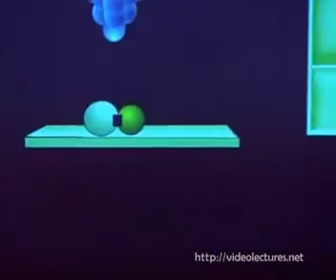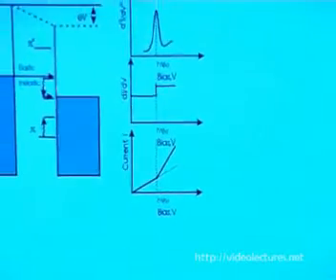Finally, the last technique is we can also weld the molecule fragments by injecting tunneling electrons.